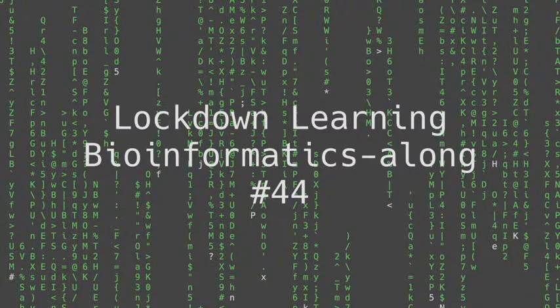And what we did on Monday in lesson 43 was that we downloaded some data that we were going to use especially for that purpose. So we downloaded some short read data that we were going to align, and we downloaded a reference genome to which we were going to align it. We started doing that at the command line, and we set up a new Conda environment to do that from, and got ourselves to a point where we had all of the data that we're going to need. And it's today that we're going to look at how to actually do that alignment.